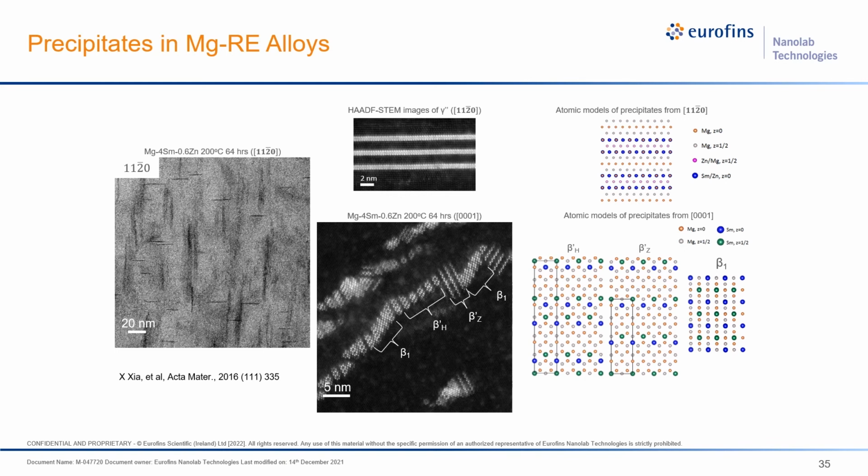From these two high-resolution STEM images, you can clearly see that these two kinds of particles have very different crystal structures. And actually, in this one bigger particle, you can see a couple of small crystals. So you can use these images to directly analyze the crystal structures of these particles, and also use the high Z contrast, the atomic number contrast characteristic of STEM images, to help you analyze the atomic model.